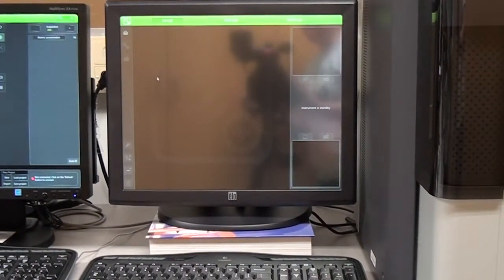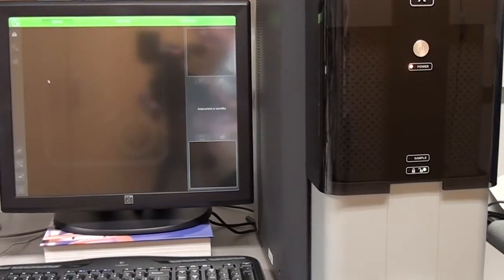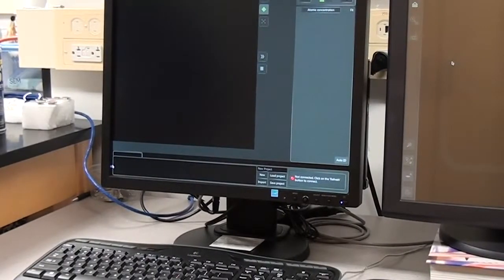There are two monitors. One shows the image generated by the SEM, and the other monitor is connected to the EDS system and is used to obtain information about elemental composition.